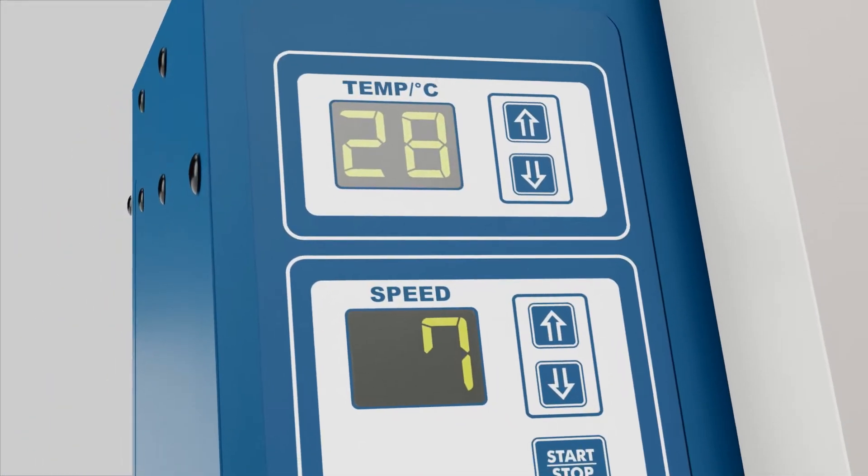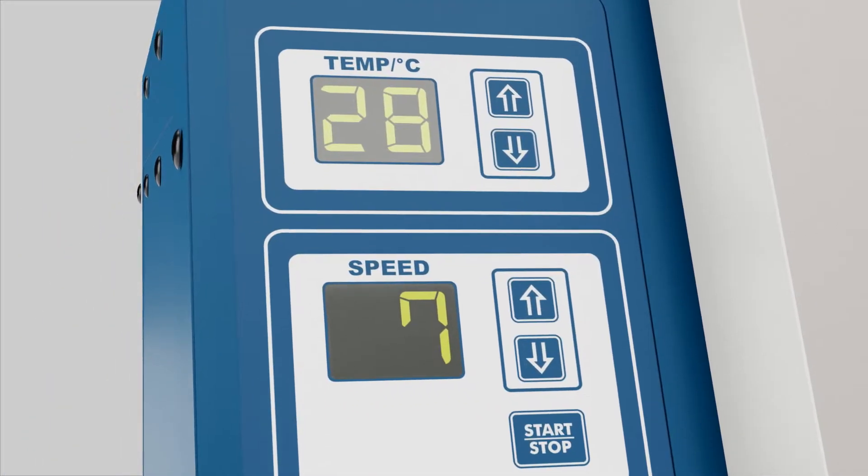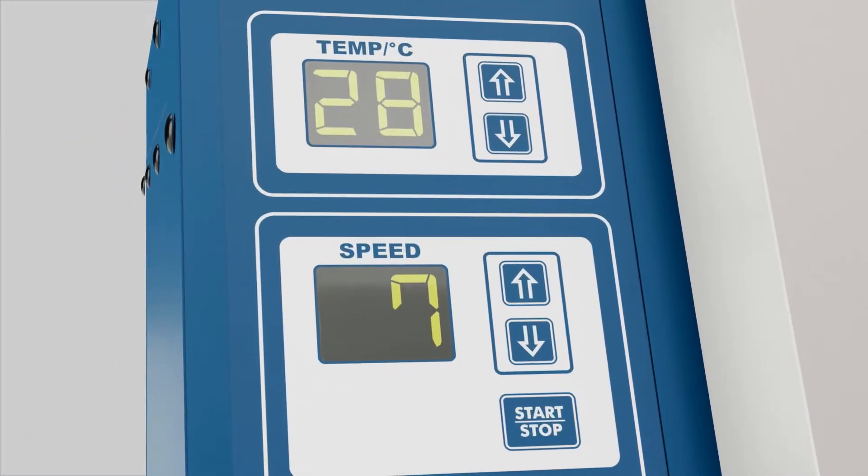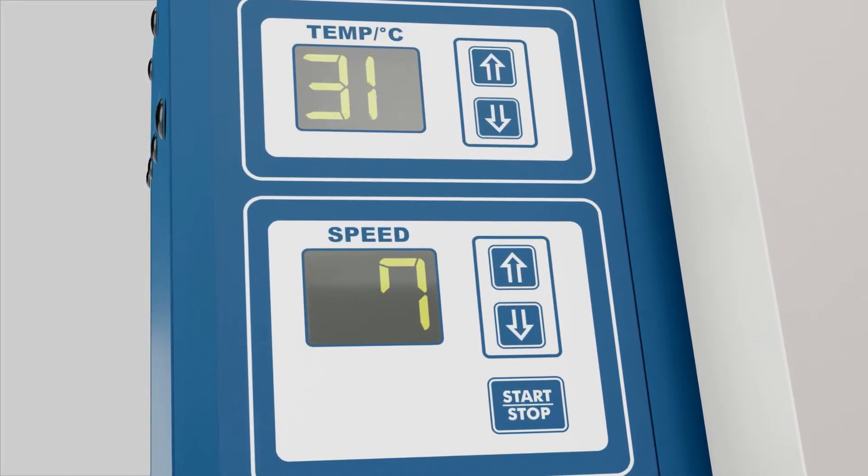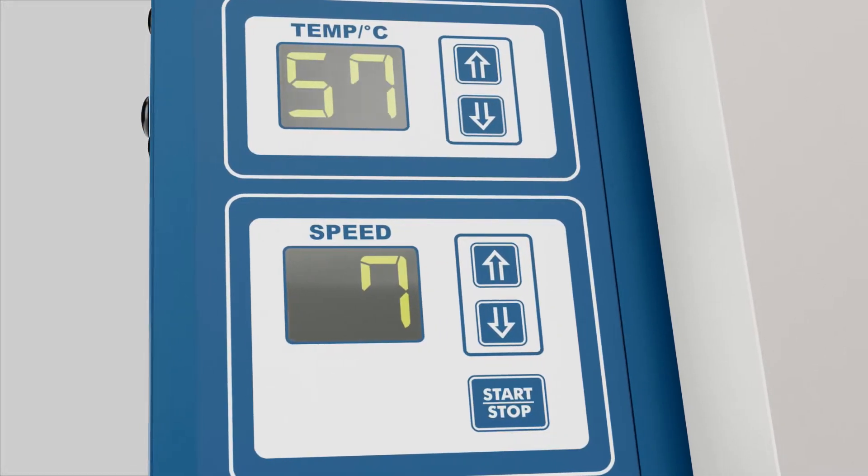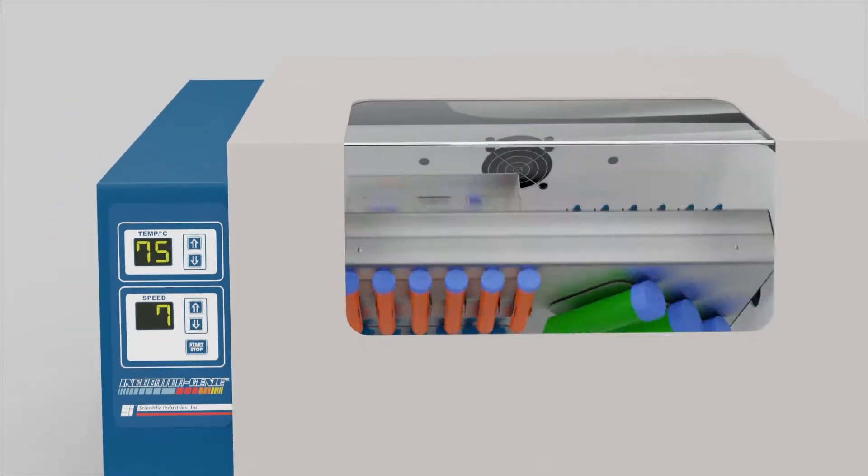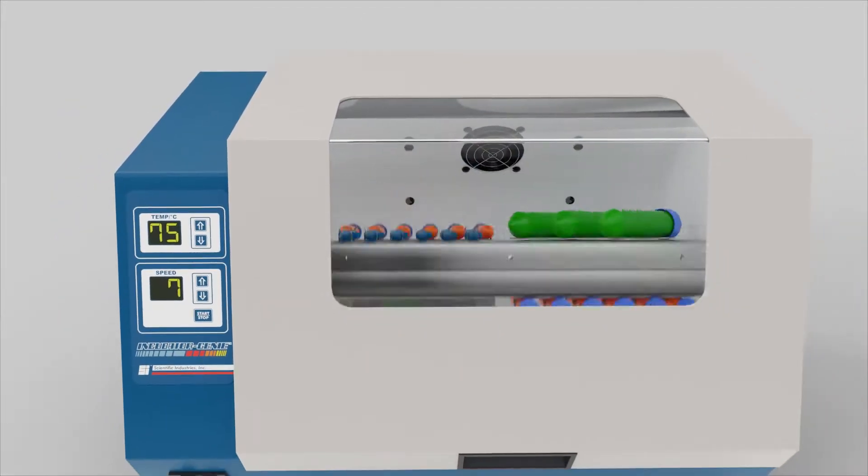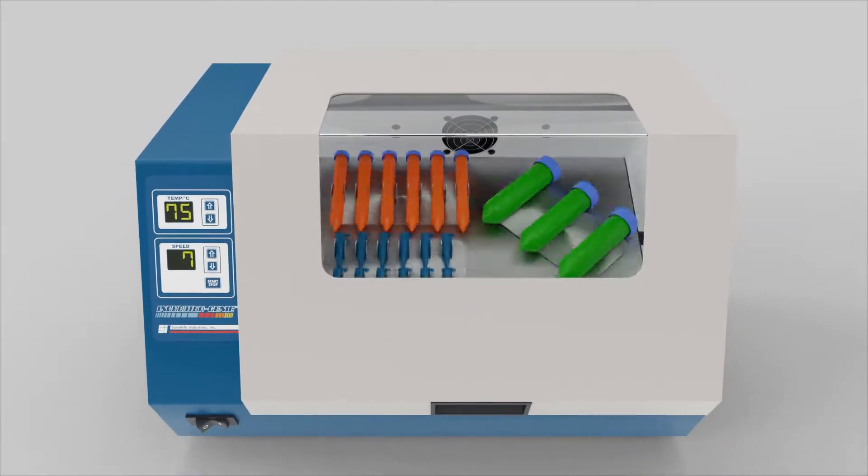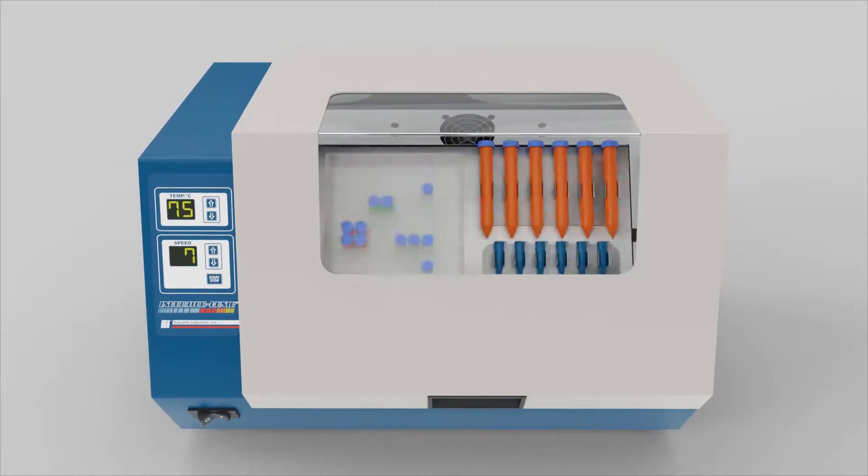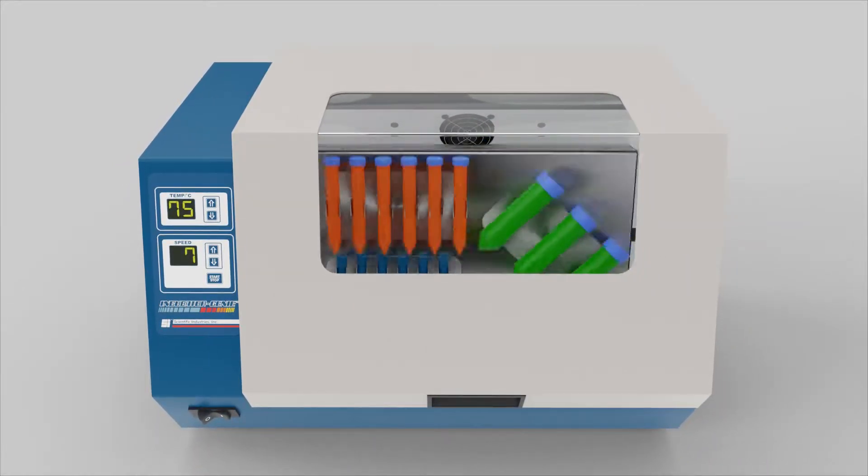IncubatorGenie's pulse width modulation accurately controls heated incubation between 28 and 75 degrees Celsius, making it ideal for hybridization processes and almost any other heating application.